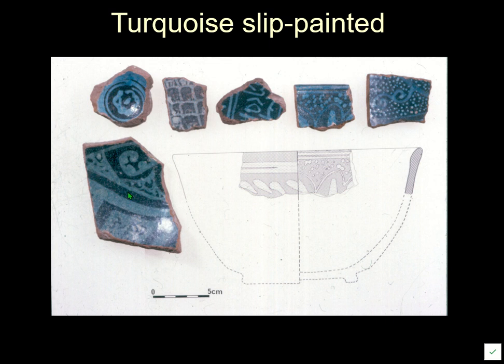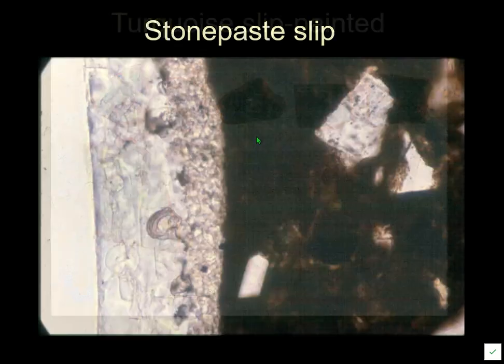This has a red clay body and a white slip on it. Sometimes it's a clay, sometimes it's not a clay, it's crushed quartz. The chronology of this is actually trying to, in a way, emulate blue and white pottery, ultimately from China, although probably what they were copying were imports from Iran that was copying pottery from China, or influenced by pottery from China. As you can see, it's very far away in appearance and motifs, but ultimately that's what it's related to.